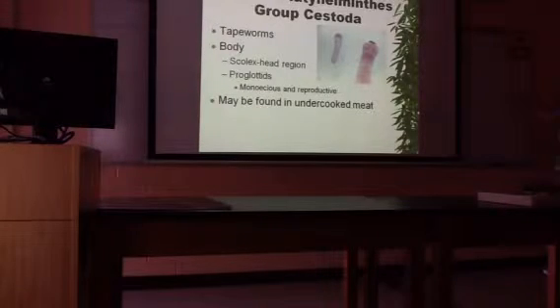The head usually has 2 eye spots. They don't see. They may possibly be able to detect light and dark. They might be able to tell it's lighter over here and darker over there, but they're not seeing shapes or color or anything like that. Okay, so very limited function on those eye spots. And then most of them have little barbs around their mouth, which would be at the top of the head.